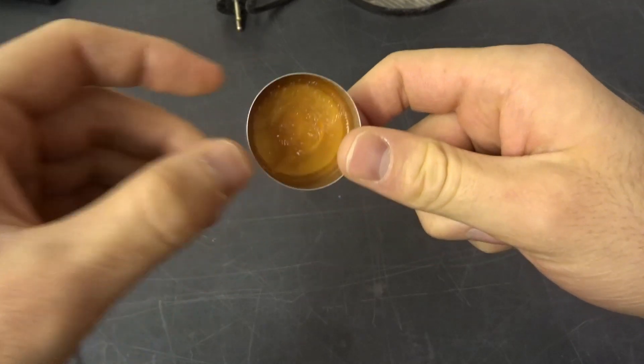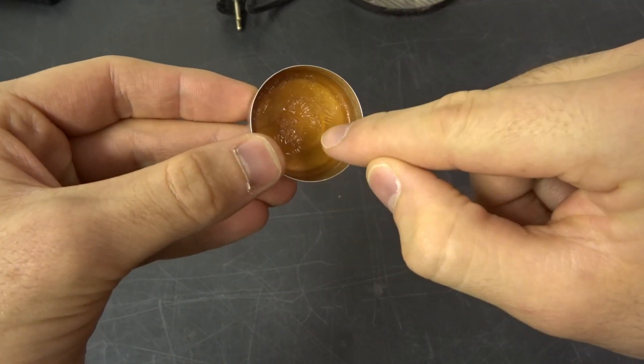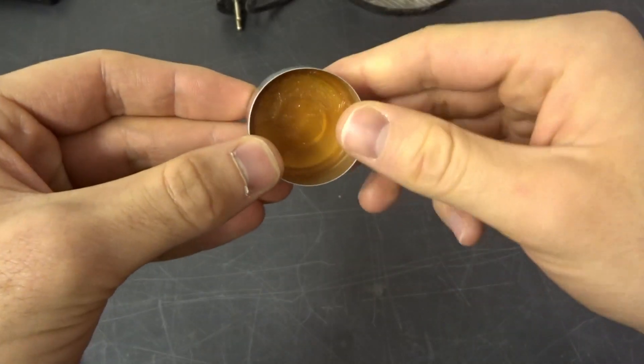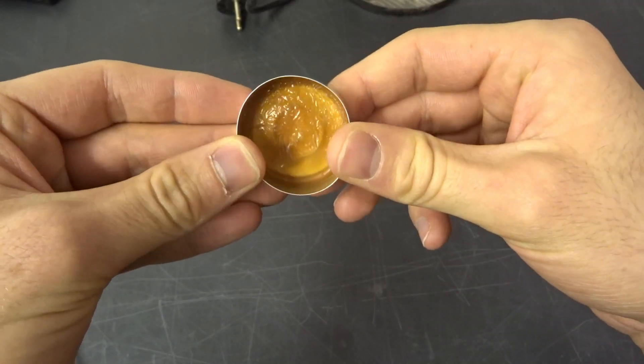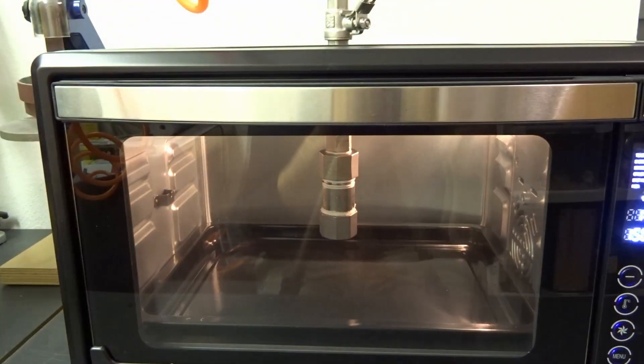So I guess around 5 to 7% is about the optimum you can get. And as you see here, using this wide open aluminum dish allows for more water to evaporate than the test tube. Using this tube also contributed to this more water-free precursor. You can also try drying it.